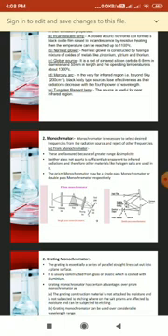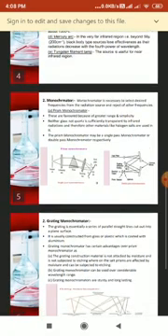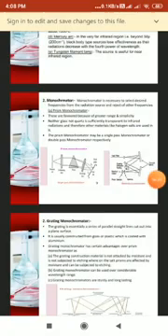The prism monochromator may be a single pass monochromator or a double pass monochromator. Now we have seen the single pass monochromator. The sample is kept at or near the focus of the beam just before the entrance slit to the monochromator.